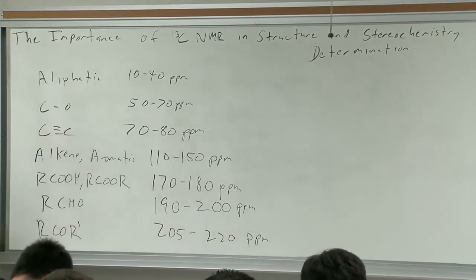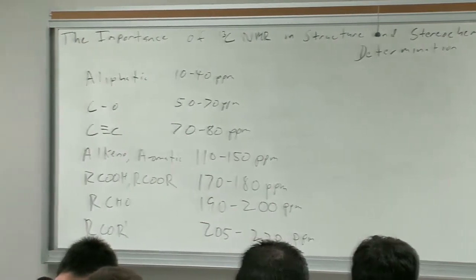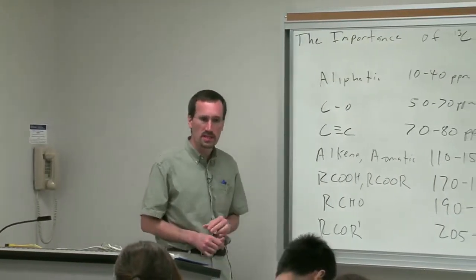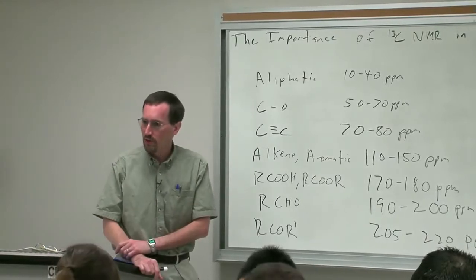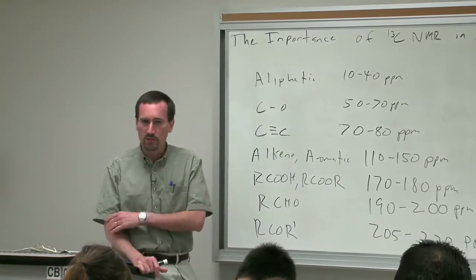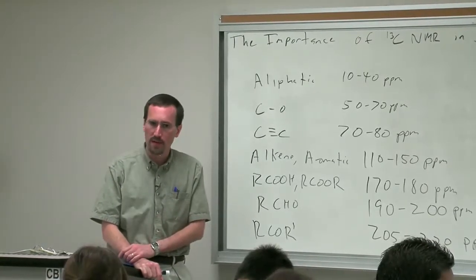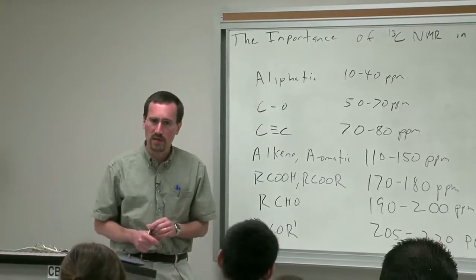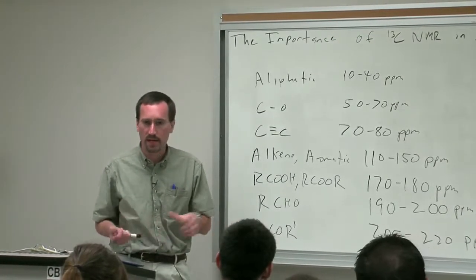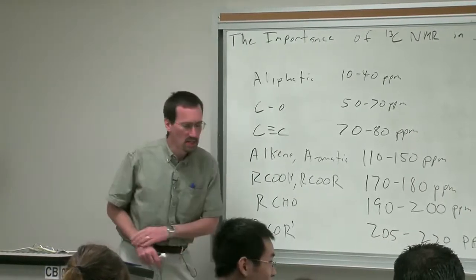All right, so I want to finish up what I'll call basic NMR spectroscopy today. In other words, things that all fall at the level of basic interpretation of structures, and in turn things that we'll get on the midterm. Next time I'll pick up by introducing 2D NMR, and then our next homework set, not Monday's, but the one after that, will start using 2D NMR spectroscopy.